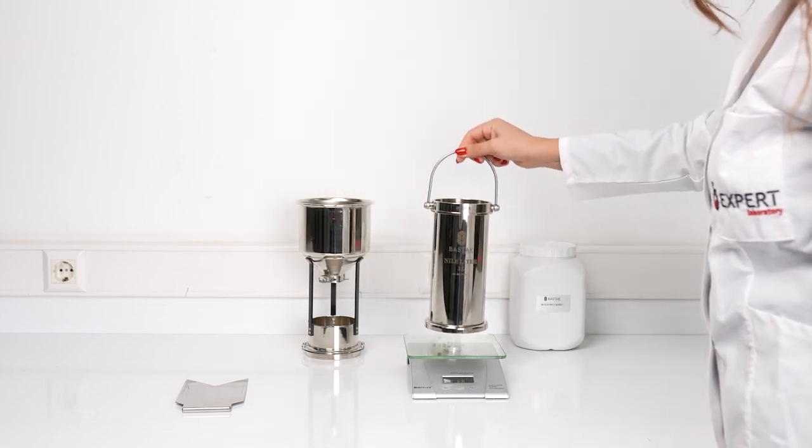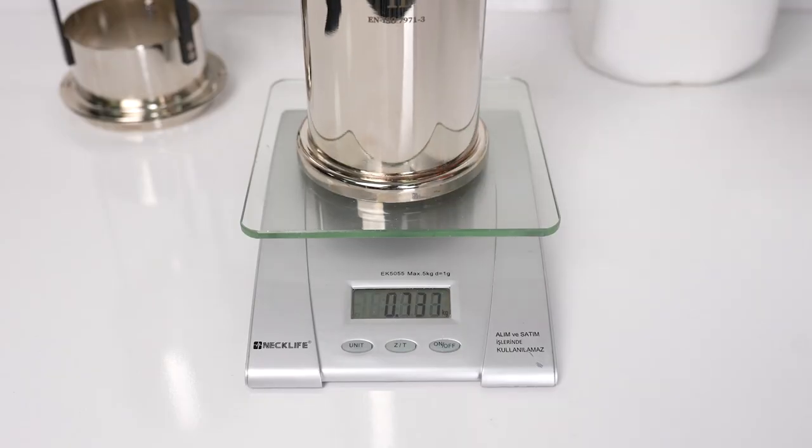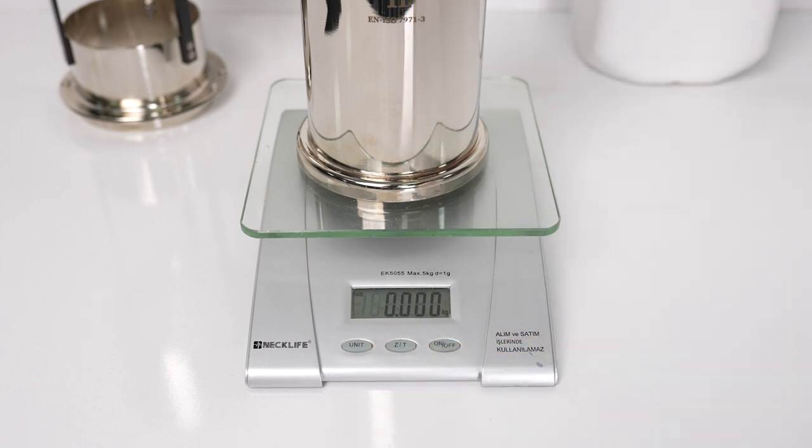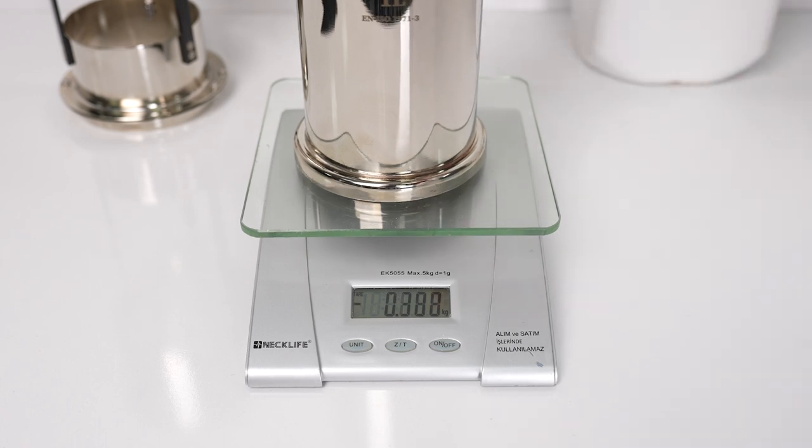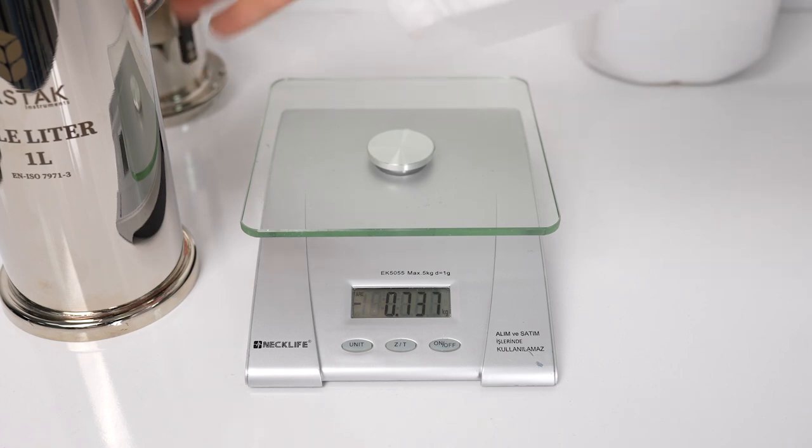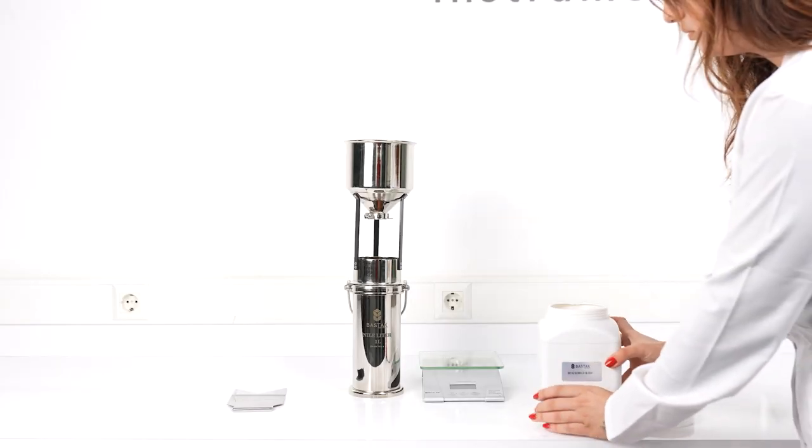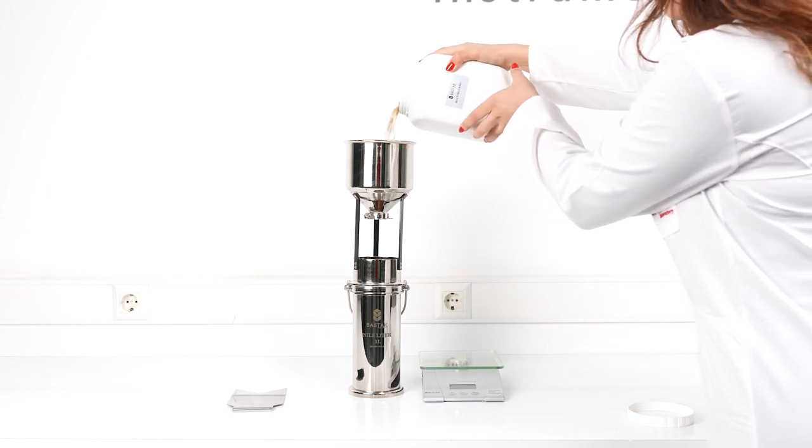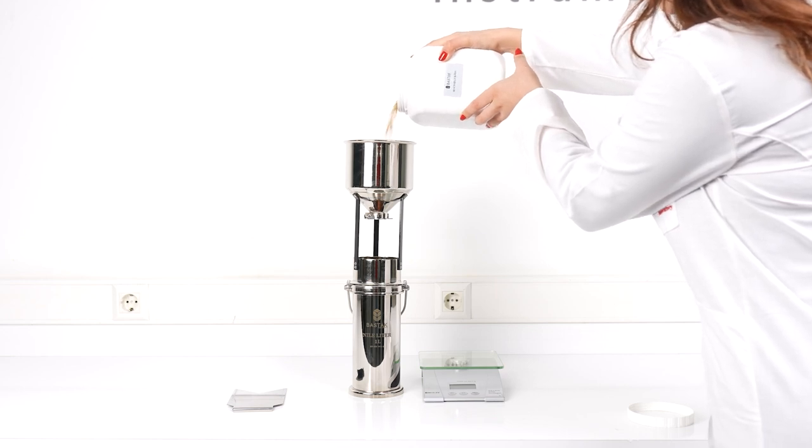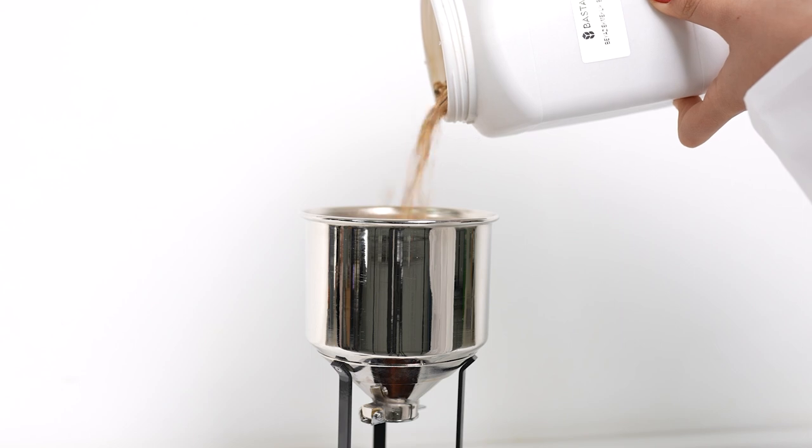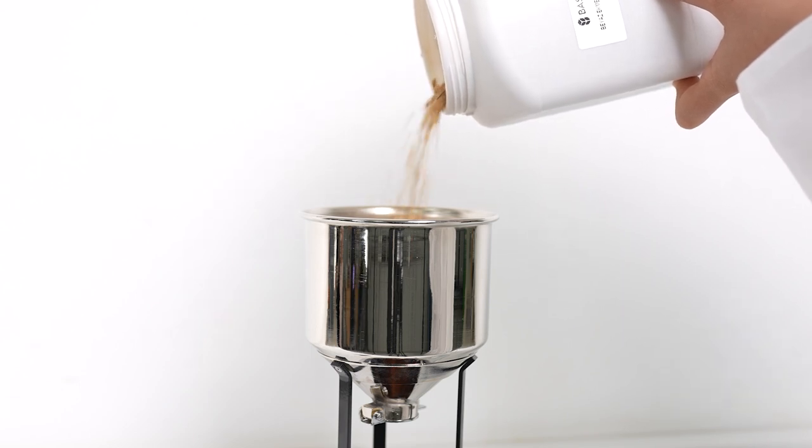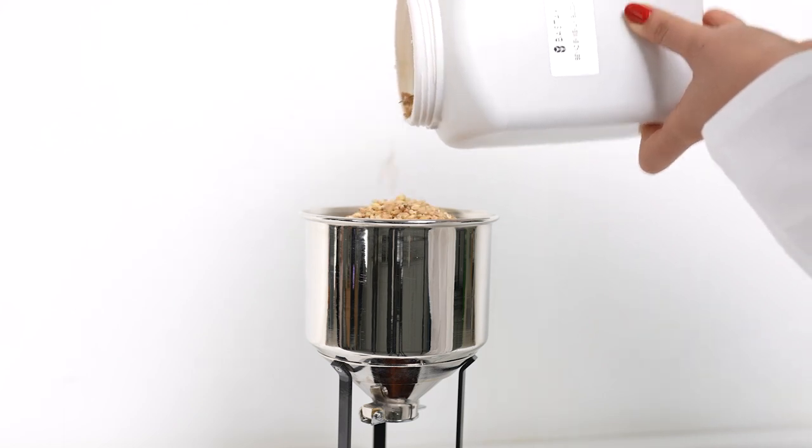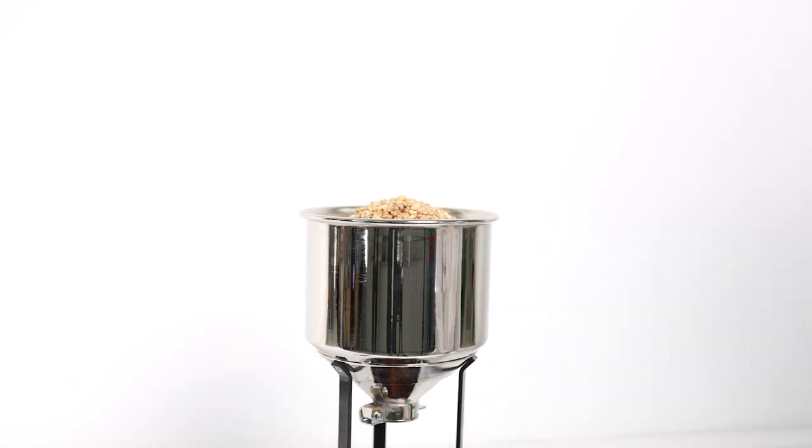Before starting the analysis, the empty measurement container's tare weight is measured using a digital scale with 1 gram precision and noted. Then the filling container is placed evenly on top of the measurement container. The homogenized sample to be analyzed is poured into the filling container.